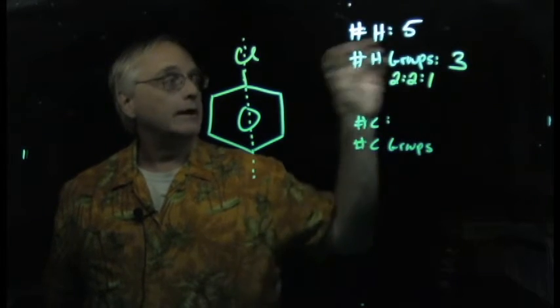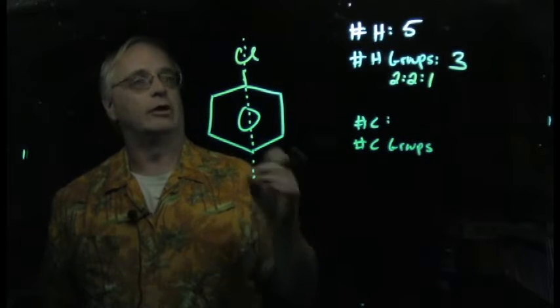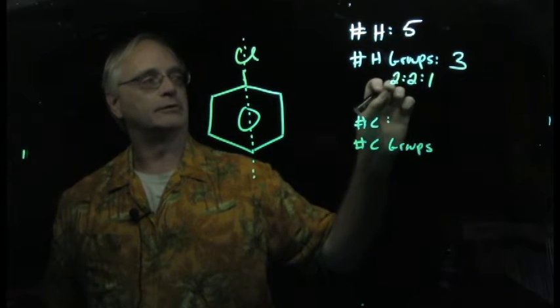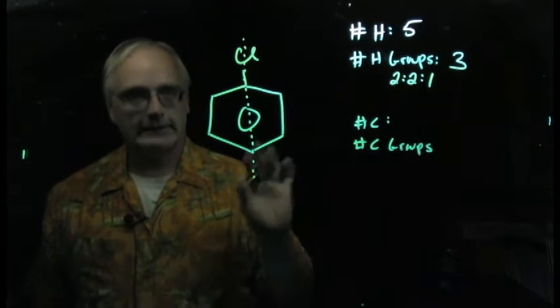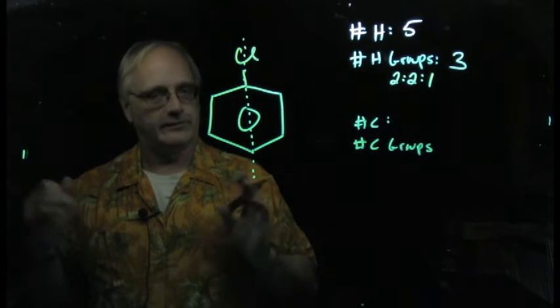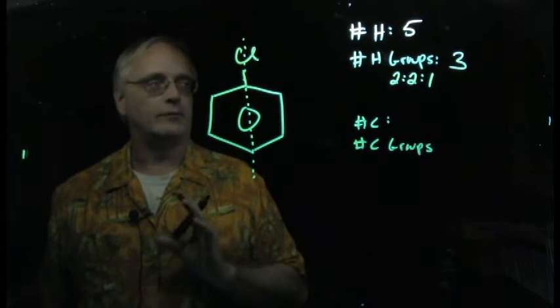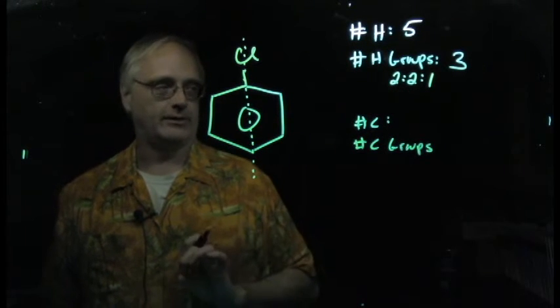Now, remember, ideally, a proton NMR spectrum will show in the aromatic region 3 groups integrating in a beautiful 2 to 2 to 1 ratio. In reality, it may look like that. Some of this, because it's a proton spectrum, can be compressed and somewhat overlapped. So this would be the ideal scenario.